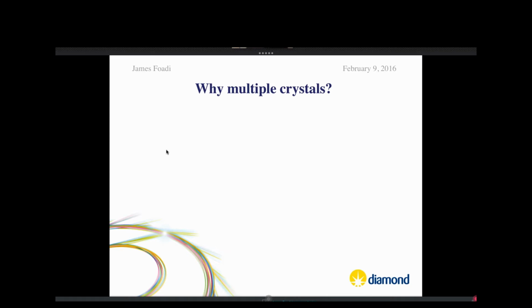discussing why just one crystal is not enough any longer to solve crystal structures. Of course, this is not really true. A nice, good-sized homogeneous crystal that survives a whole data collection is always going to be the preferred choice for crystallographers. But such crystals are not easy to obtain, especially for difficult structures like membrane proteins or protein complexes. And when the optimization strategy for crystal growth is successful, this normally, as you well know, requires long periods.